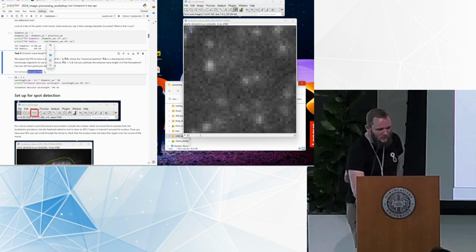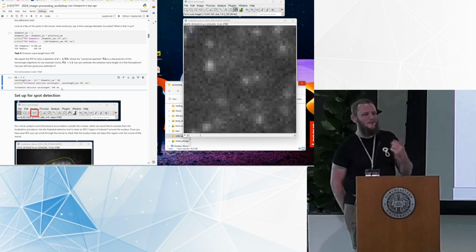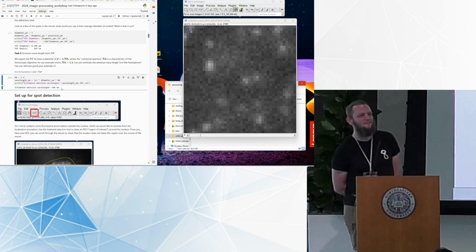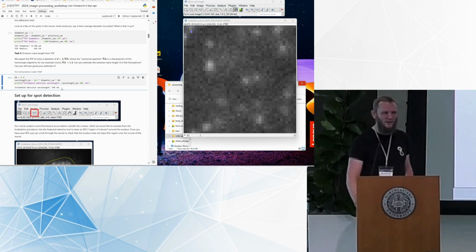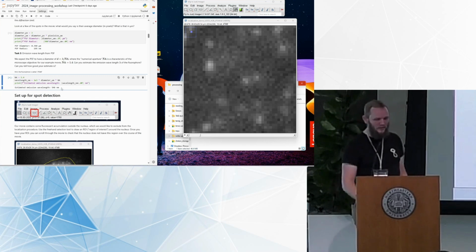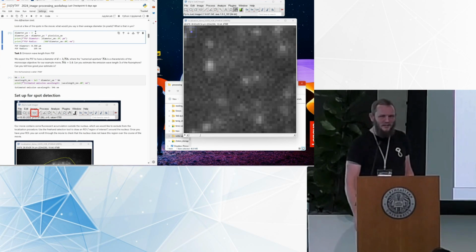The fluorophore we have is called JF549. Does that help anyone in figuring out whether our estimate is reasonable or not? You're nodding. Right, seems decent. So the 549 in the name of the fluorophore stands for the emission wavelength in nanometers. So we know that this fluorophore emits at 549 nanometers. By just looking at the movie, we estimated 546. That's not too bad. I should say this is a little bit lucky because we just put an integer here for the diameter of this point spread function.